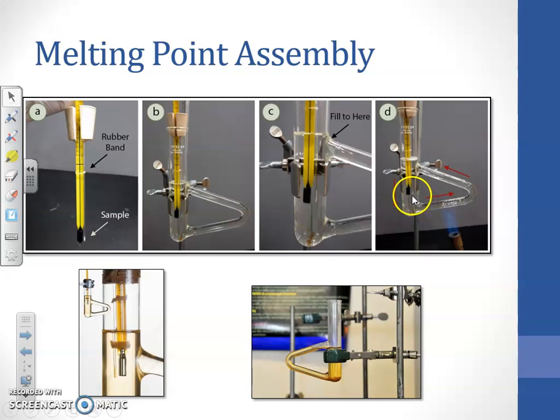How to determine the melting point? We have to heat it slowly at the side arm, so that there is a gradual increase in the temperature, and we have to observe both the temperature on the thermometer and the substance in the fine glass capillary. Both things are observed while heating, and we note down the temperature at which the solid melts and converts into liquid. That temperature is called the melting point of the substance.